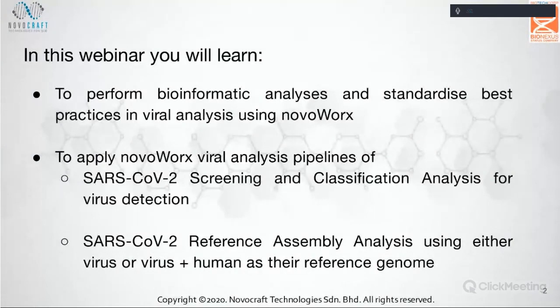At the end of the webinar, we hope that the attendee will be able to perform bioinformatic analysis and standardize best practices in viral analysis using novoWorx, and also to apply novoWorx viral analysis pipelines of SARS-CoV-2 screening and classification analysis for SARS-CoV-2 virus detection and SARS-CoV-2 reference assembly analysis using either virus or virus plus human as their reference genome.